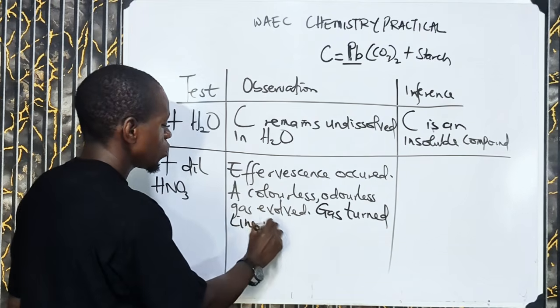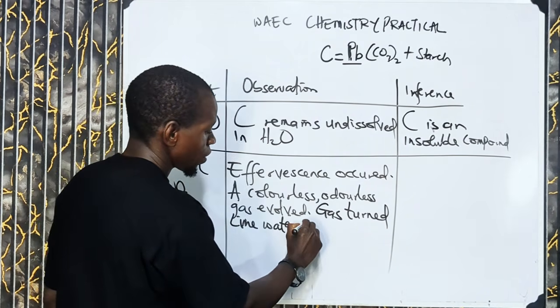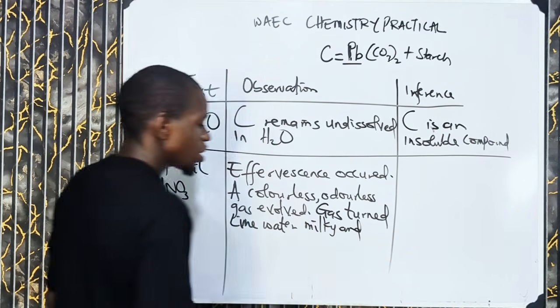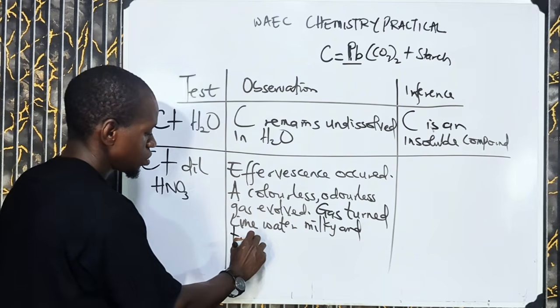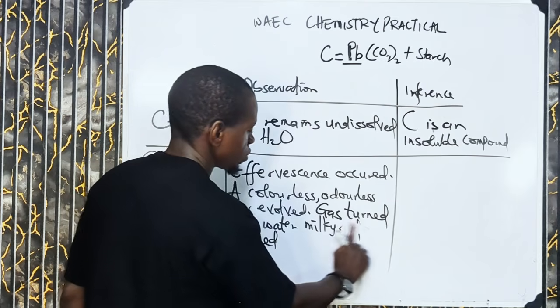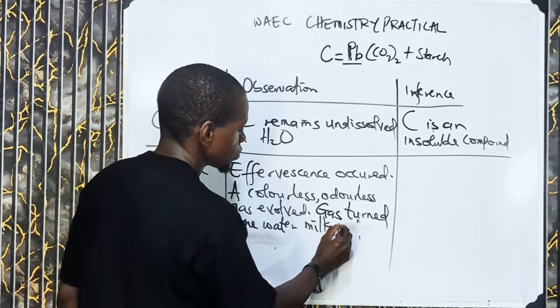Lime water milky. Sorry, I meant this: gas turned lime water milky. So let's stop here now.